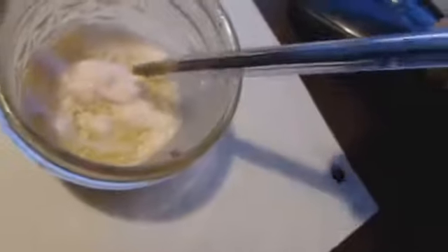Now I could take that out, even though it's a 50-50 ratio, right? Break these chunks off of here or whatever, or get it before it dries, and separate the clumps, and then recrystallize those clumps. You know, I have two piles of clumps, one pink, one white. Well, my whole point here is that you can do this with the sodium chloride and the dichromate. Let it evaporate real slow, and they will separate into crystals, but they'll be mixed up. They won't be that great. You know what I mean? You have to recrystallize them, but you can see that it really helps.